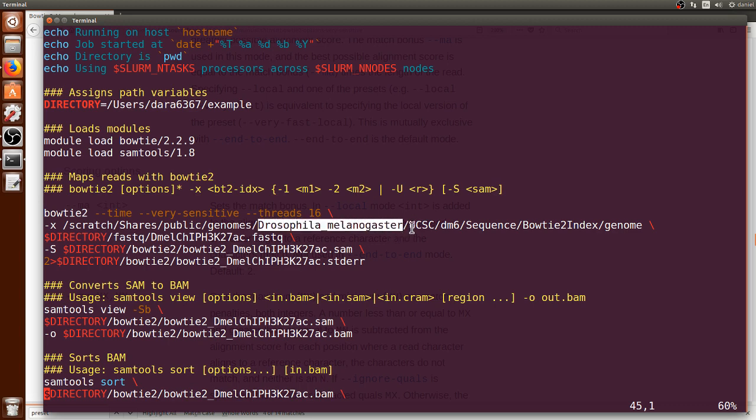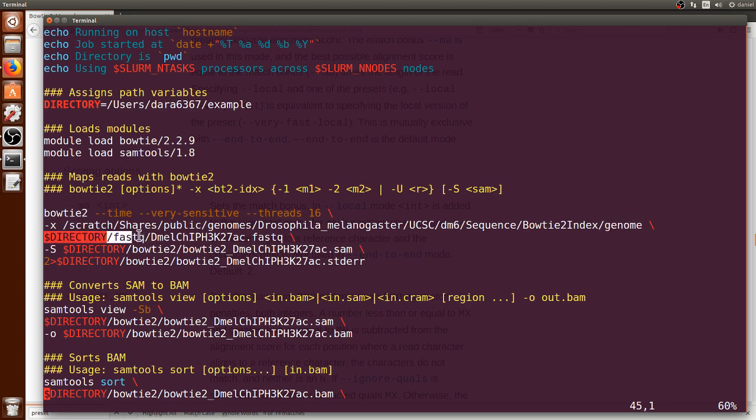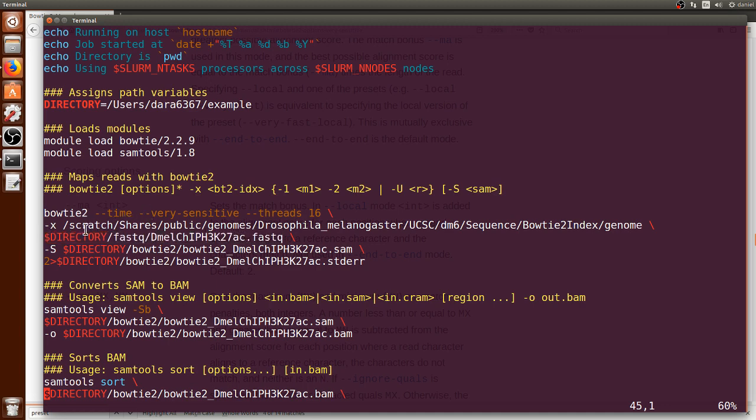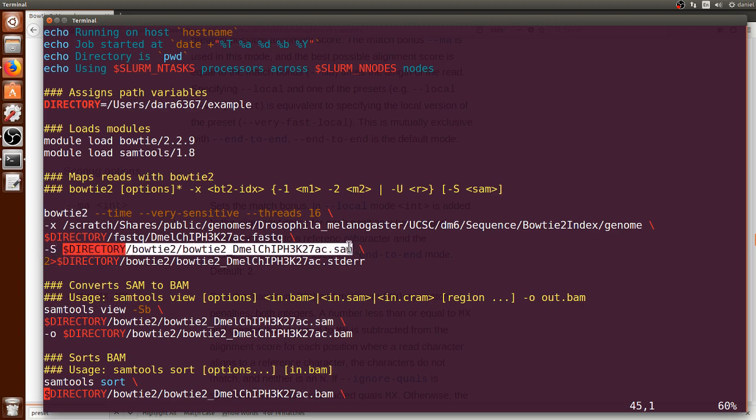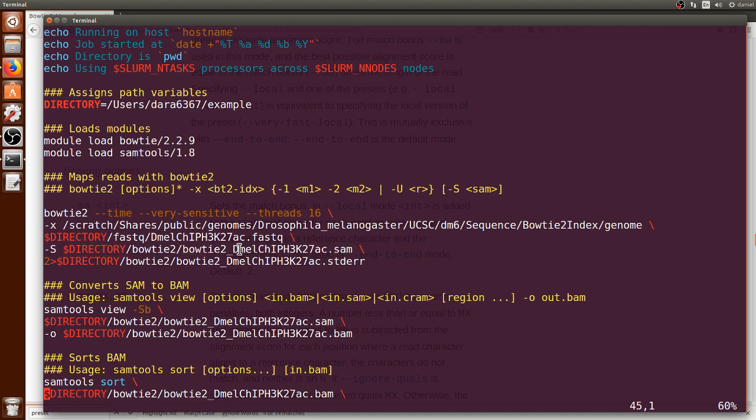So this is the Drosophila melanogaster path to the genome files and then I input the input file using the variable that I created earlier and going to the fastq directory and the name of the Drosophila FASTQ file that contains the ChIP-seq data. And then we use dash S to specify the specific output directory in a SAM format. SAM stands for sequence alignment mapping.